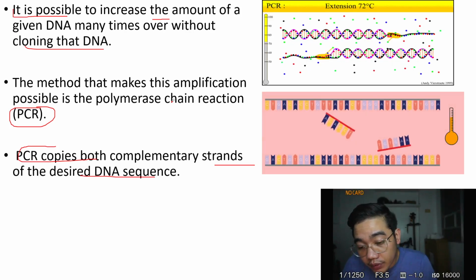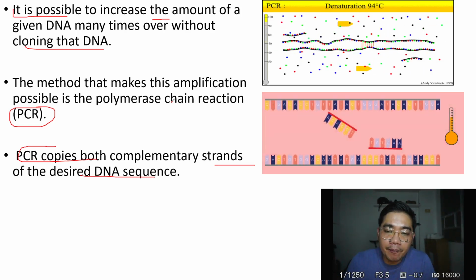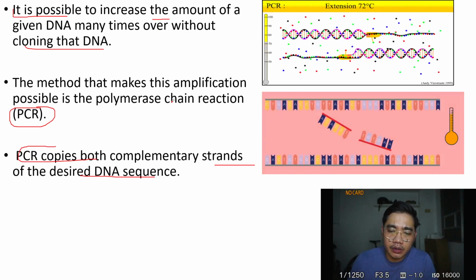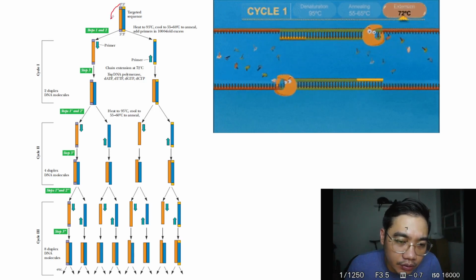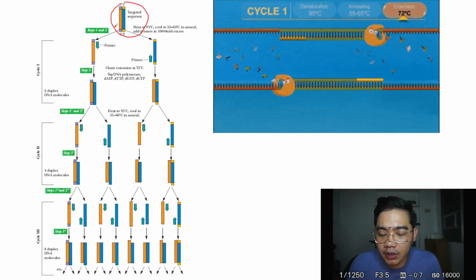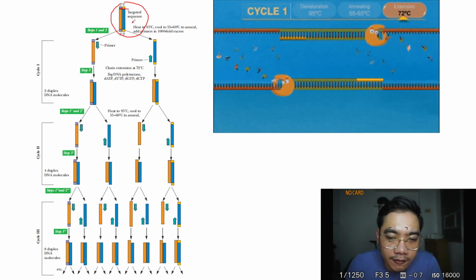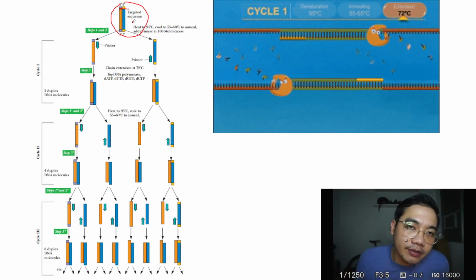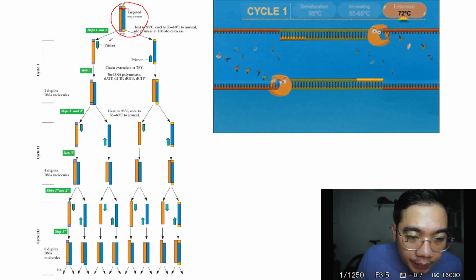So this polymerase chain reaction amplifies and doubles your genetic strand. What I want you to understand here is this table. This is the target sequence, meaning this is the DNA of your bacteria or your virus, for example your SARS-CoV-2 virus. This is the specific genetic sequence that we find in SARS-CoV-2. If it is present in your nasal swab, then we have what we call your primers.